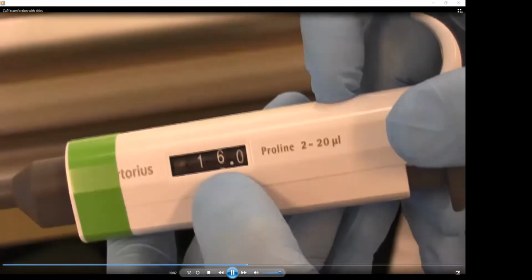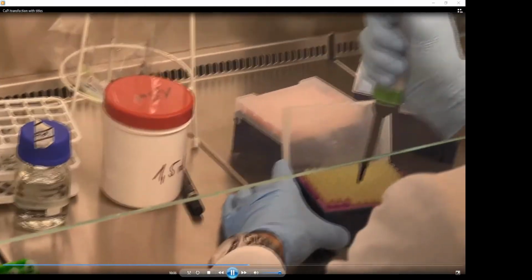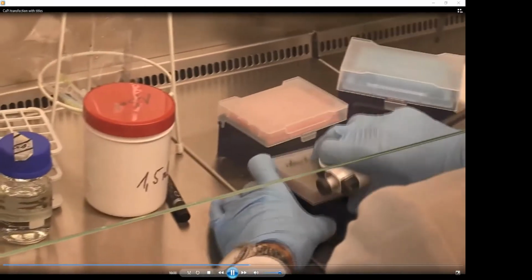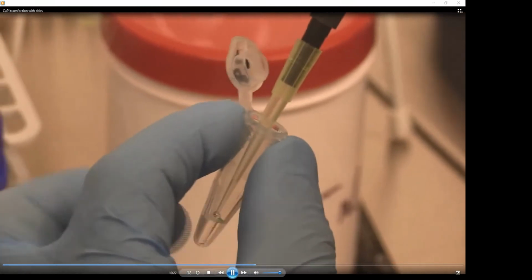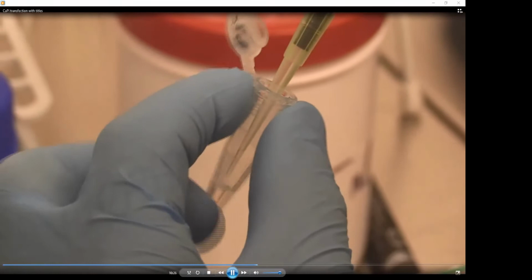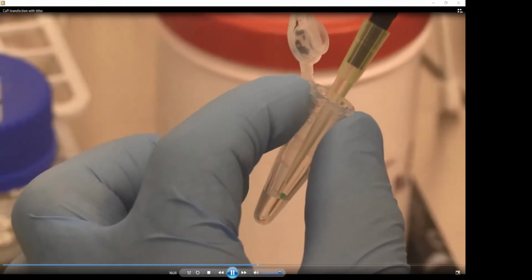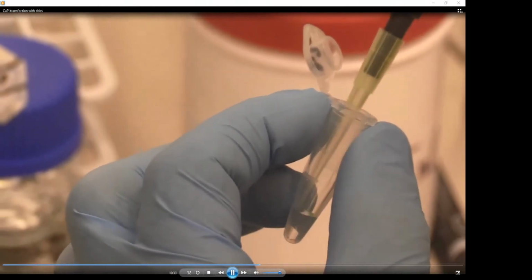And then you have to add the calcium chloride. Be careful, the volume of the calcium chloride depends on the amount of DNA. So in this case, we have a lower amount of DNA. That's the reason why we are using less calcium chloride, not as in the first sample. Once again, it has to be added dropwise, mixed after each step, and at the end, pipetted up and down 5 times.